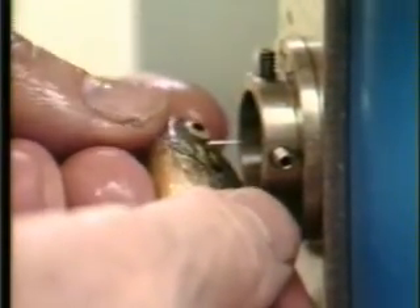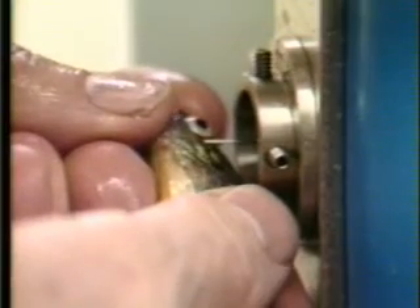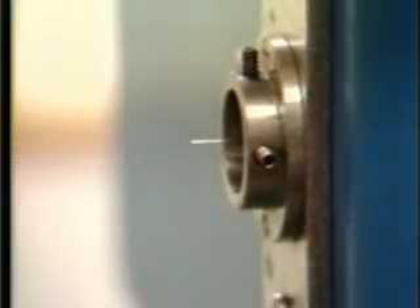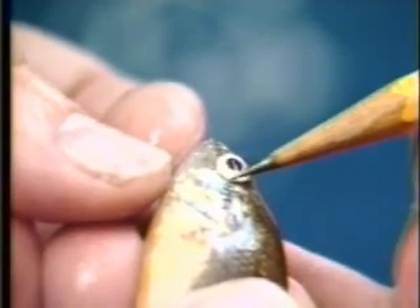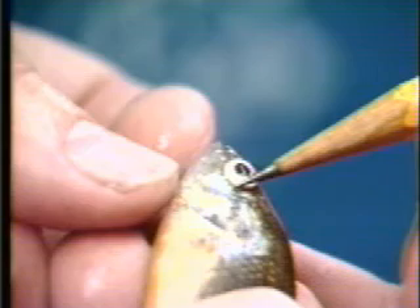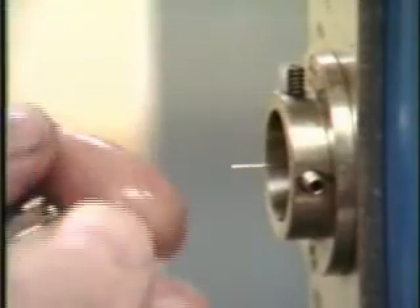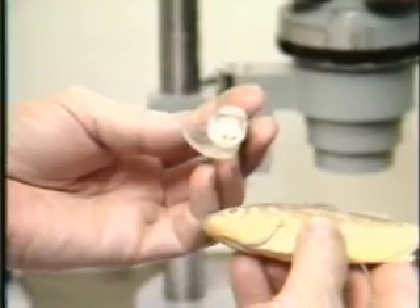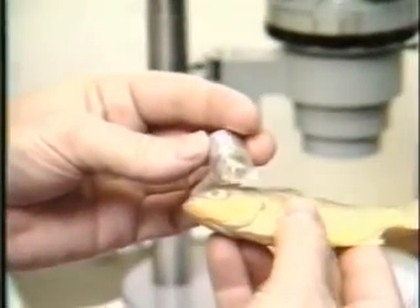In some cases, snout implantation in new species has been successful, while in other species, different tag locations are superior. For example, tagging in cheek muscle at rates approaching those achieved with salmon has become the standard method used for striped bass. This tagging is currently practiced without a head mold by impaling the fish on a fixed needle, although new kinds of molds may facilitate this procedure as well.